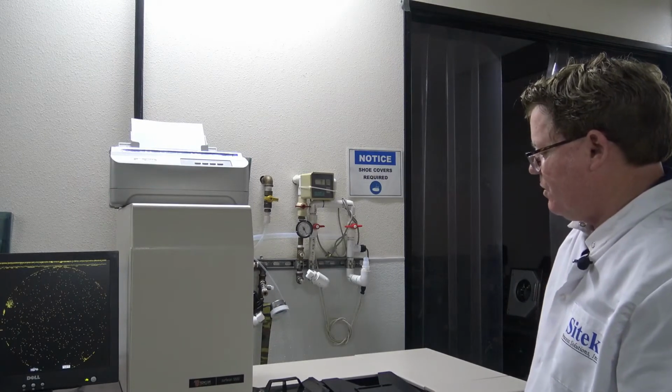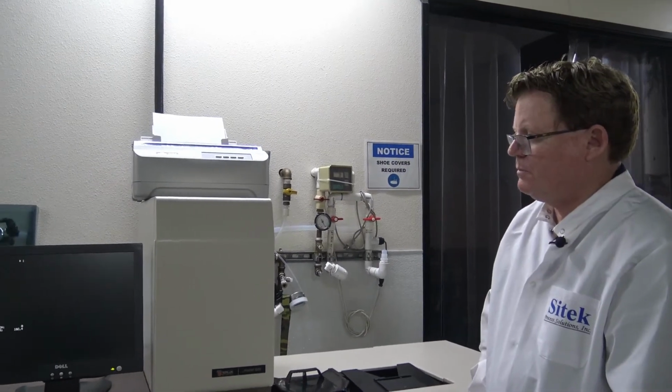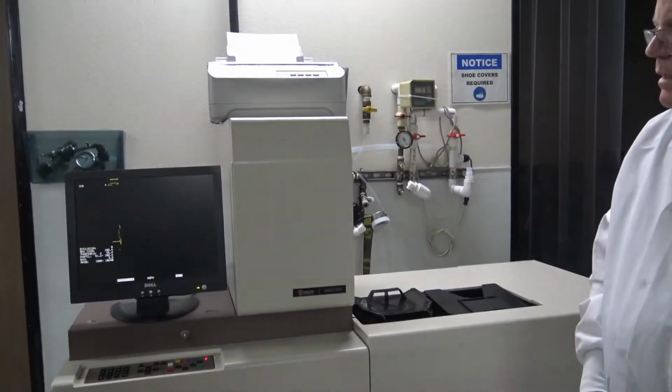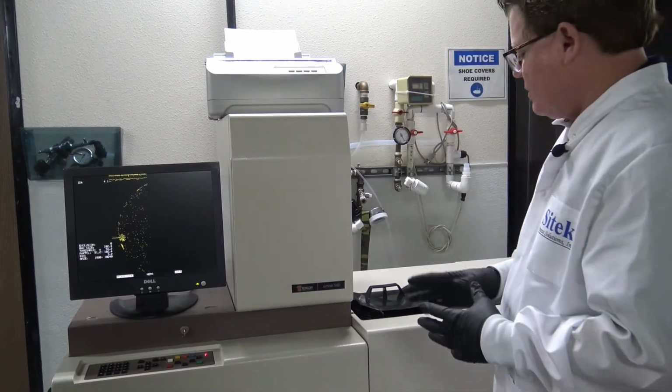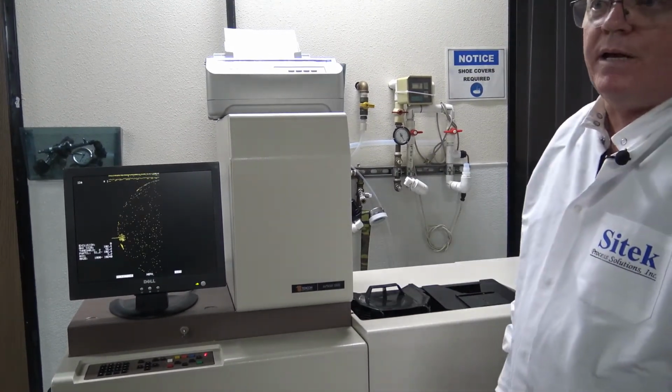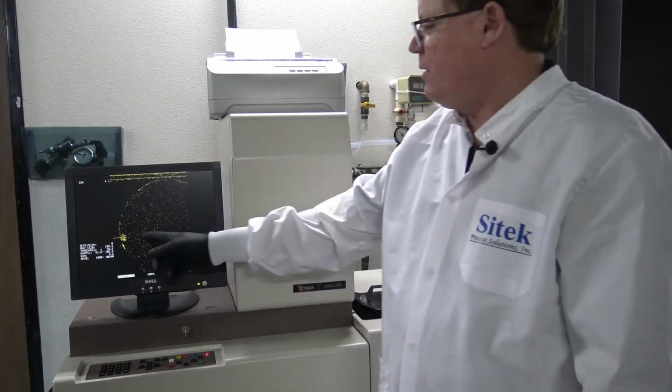Alrighty, let's measure in the first 8 inch wafer. In this case, it doesn't matter what the haze is or the overall particle counts, because in single mode, it only returns it to the cassette it came out of. As you can see, the old fingerprint.